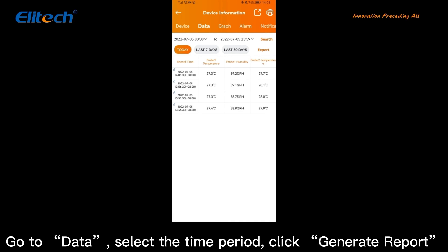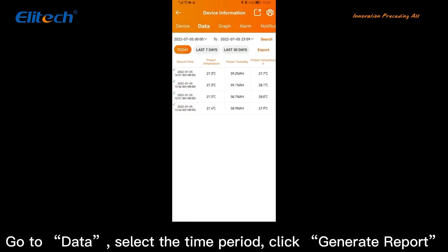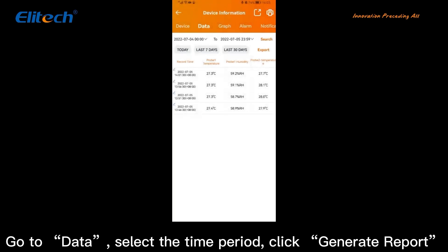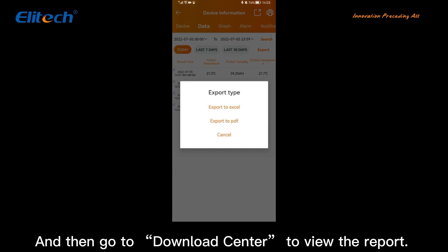Go to Data, select the time period, and click Generate Report. Then go to the Download Center to view the report.